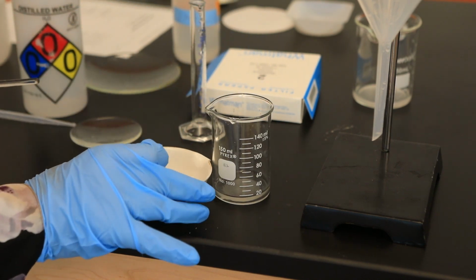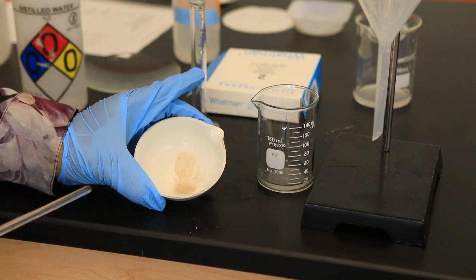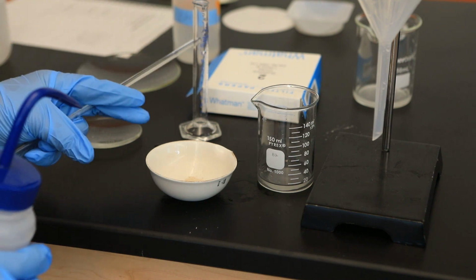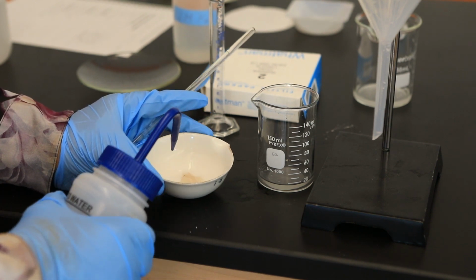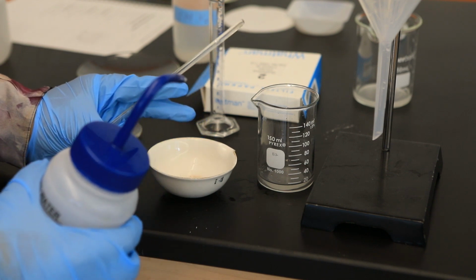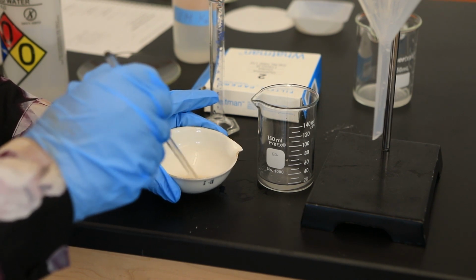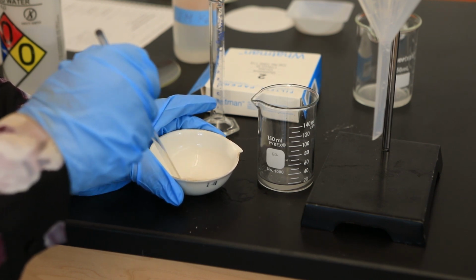And inside my evaporating dish, what do we now have? It's just sand. However, this sand certainly is contaminated with that HCl solution. And so in chemistry, we use a term called washing. All that means is that we add a small amount of a solvent, usually water. I'm using water because HCl is water soluble. So we just wash to make sure that we remove any excess HCl molecules that might be adhering to our sand.